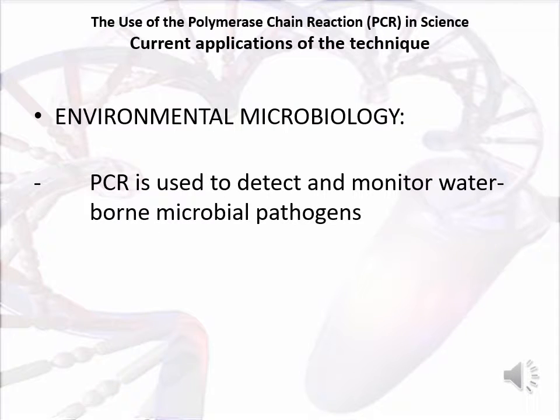The use of polymerase chain reaction in environmental microbiology. Polymerase chain reaction is used to detect and monitor waterborne microbial pathogens which may pose a major public health hazard.